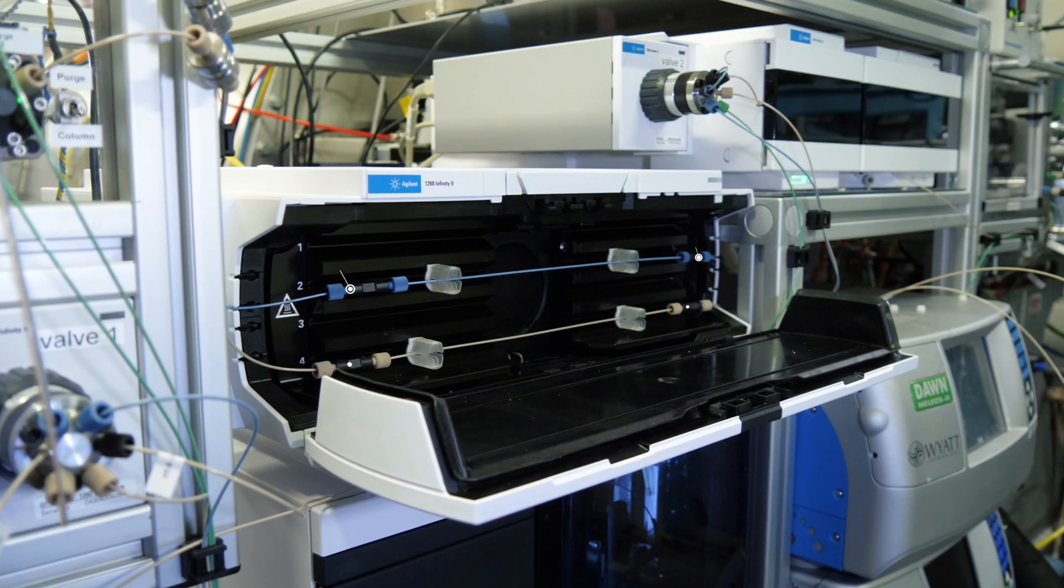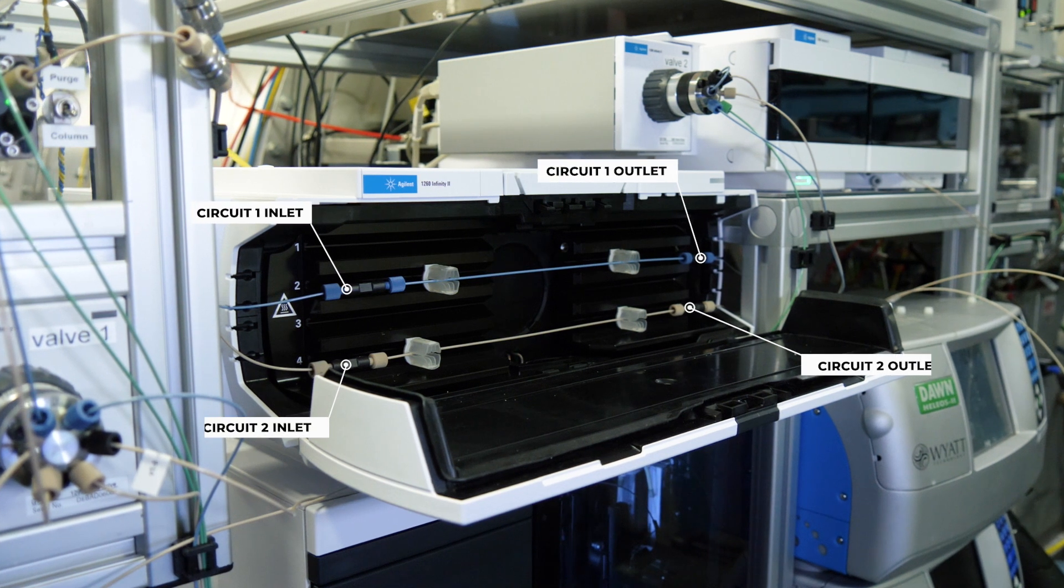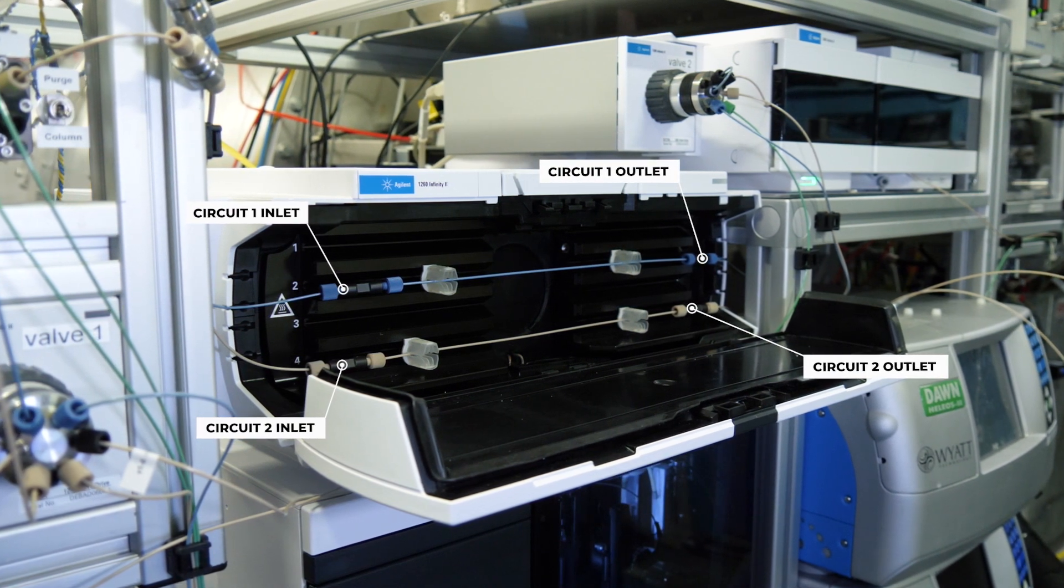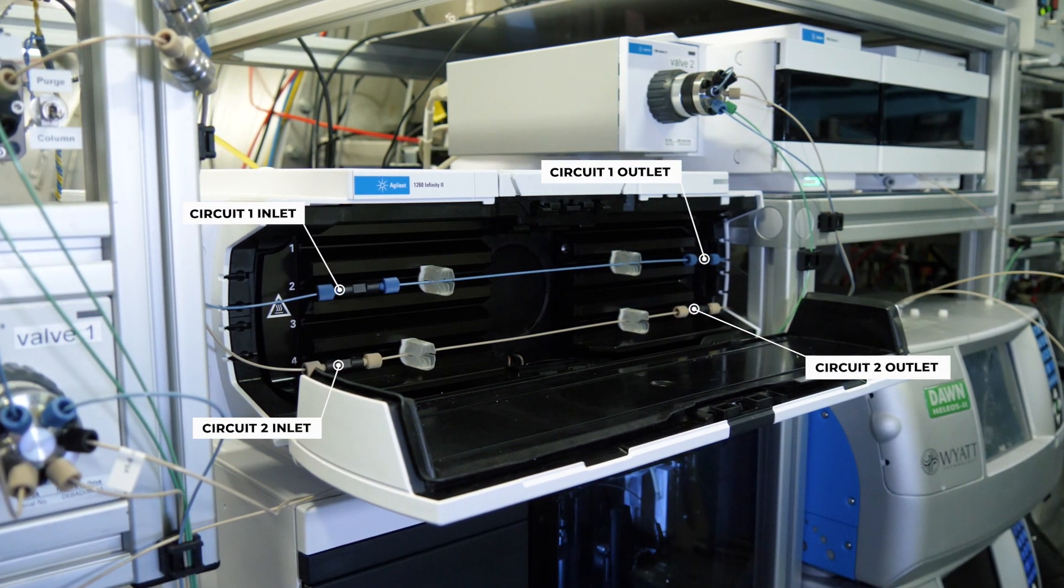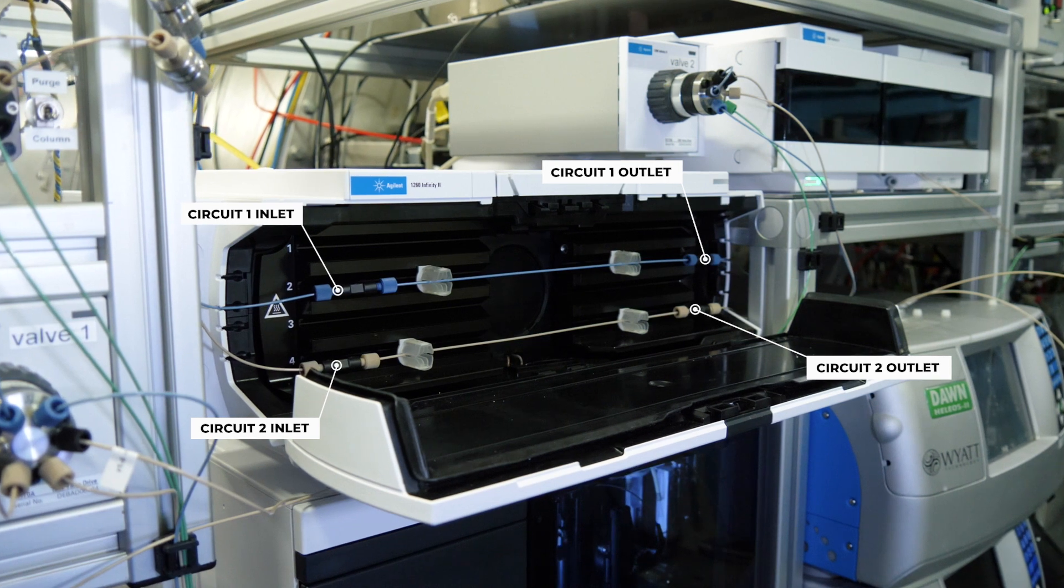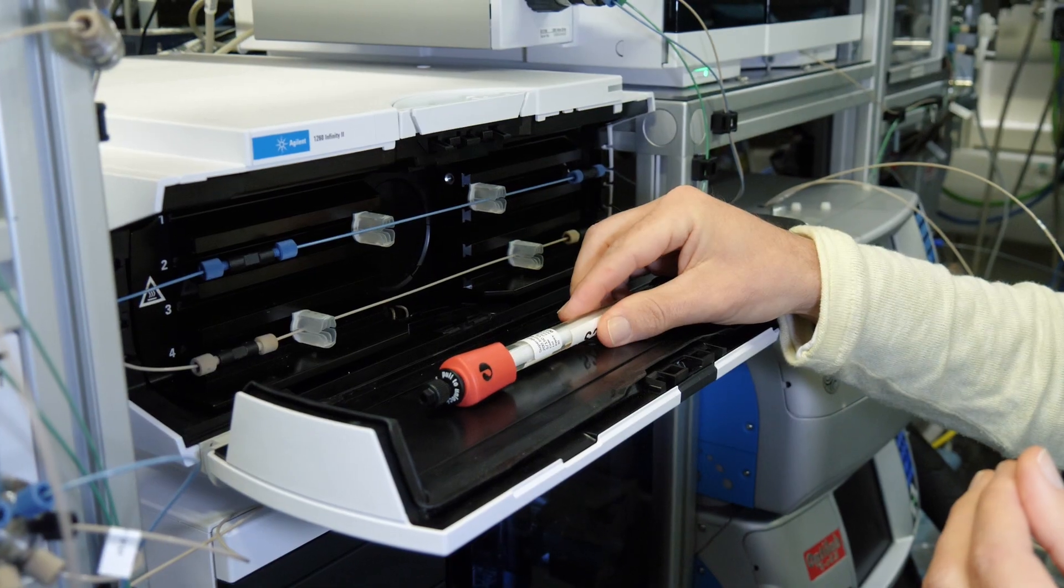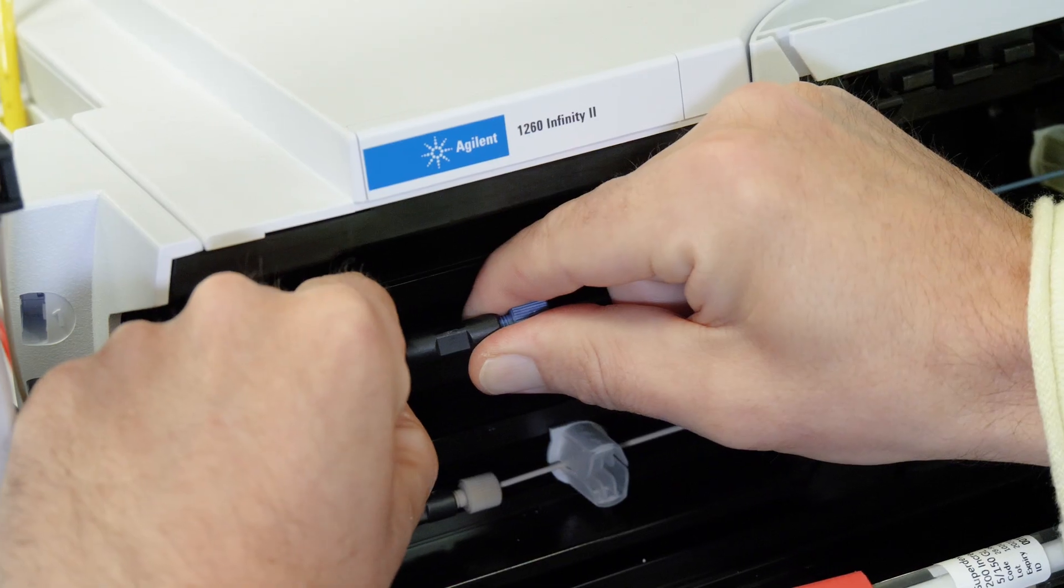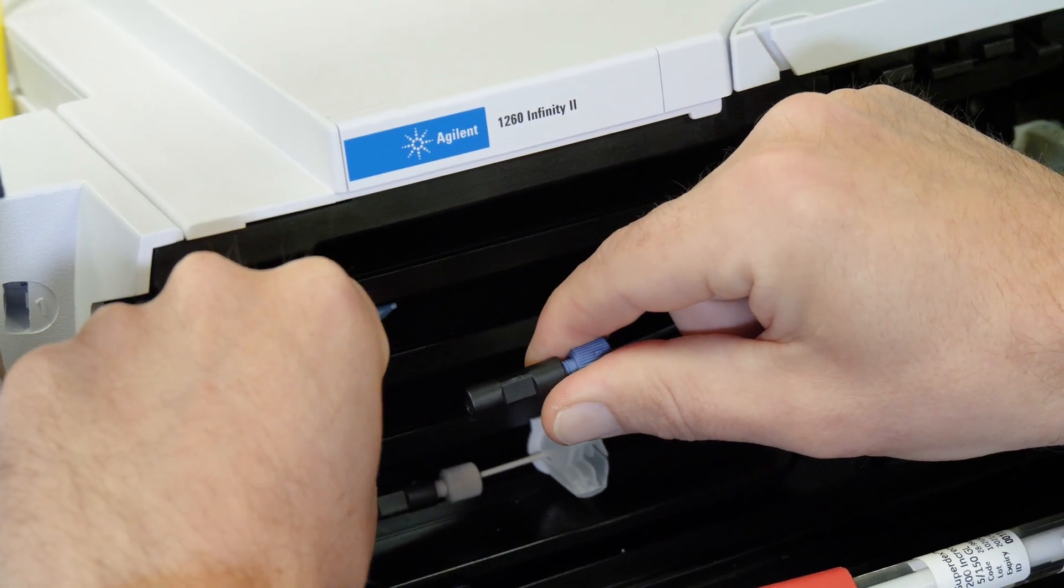Circuit one is represented with the blue tubing, whereas circuit two is represented with beige tubing. Replace the tubing between the unions in the blue circuit by the column.